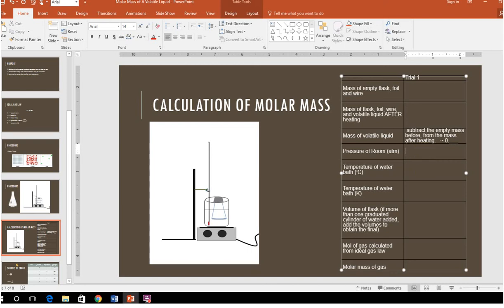Now, the pressure of the room comes from the instructor. There's only one barometer in the room and it's on the instructor's desk. It's kind of hard to see unless you tilt it just right. So either your instructor will give you the pressure or you can go look at the barometer on that desk. Just don't remove it.